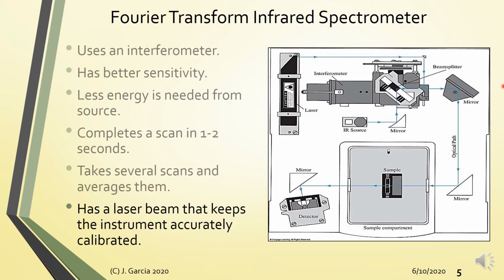So yung mga mirrors dito, mga beam splitter, mga lenses are made from salts. So mga salt window, KBr, sodium chloride. So if you have water present, it will corrode. Or siguro pinakamadaling explanation, it will dissolve away your salt window. So no ang water. Okay?